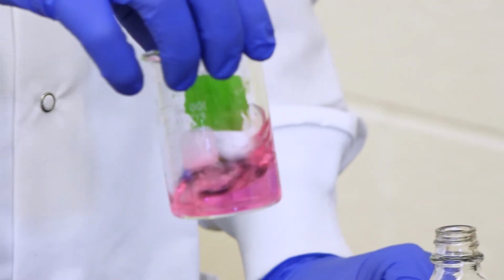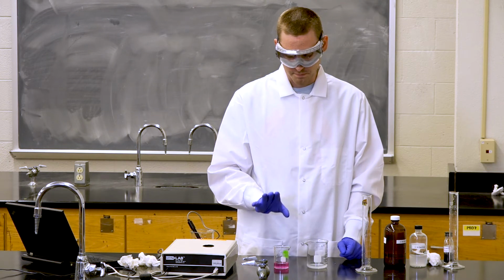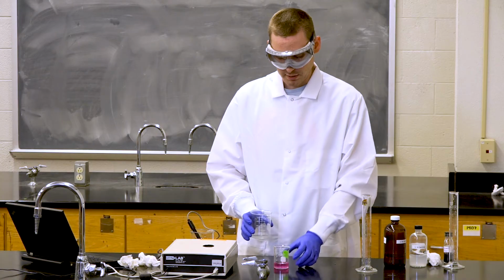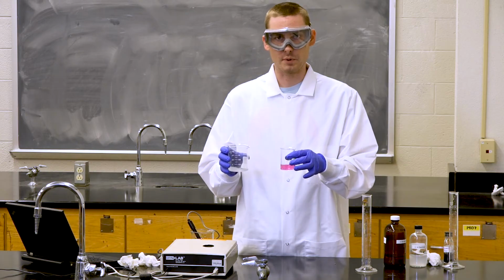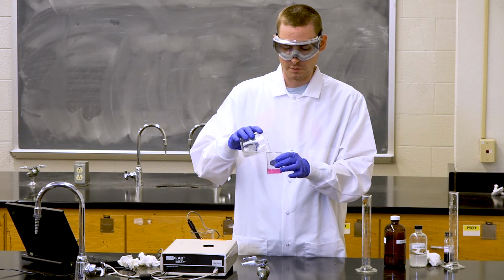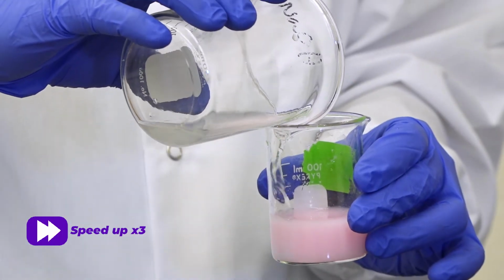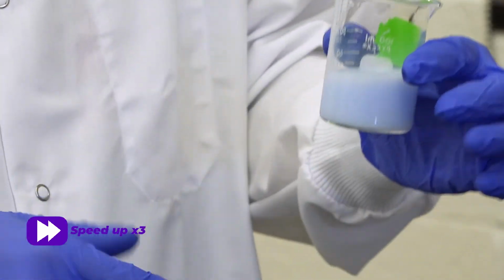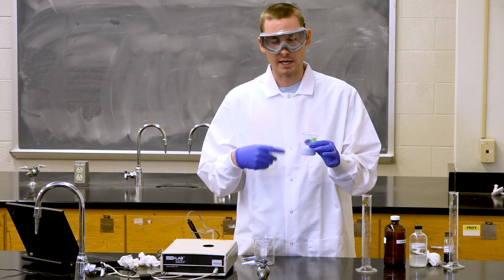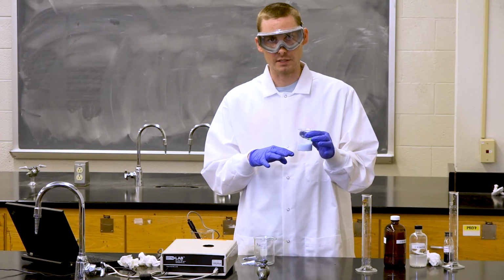We can then slowly add our barium hydroxide solution to our sulfuric acid solution until the indicator changes colors, and at that point we want to stop. You can either do this dropwise or you can carefully pour it into the sulfuric acid solution. So the end point will be a bluish color. It's cloudy because the barium sulfate is forming a precipitate, which is suspended in solution.